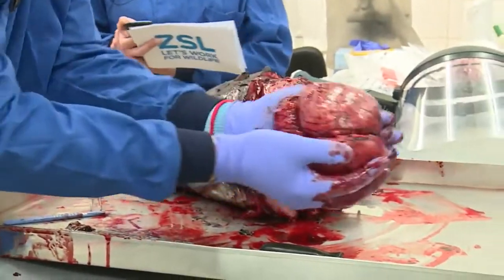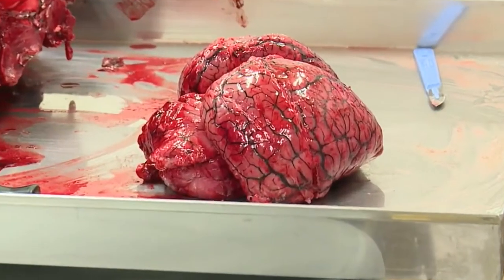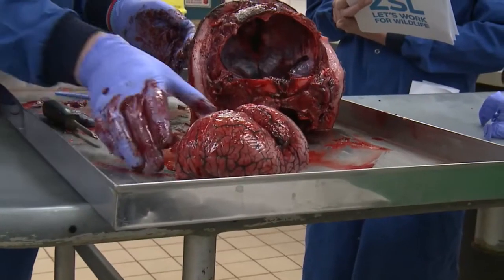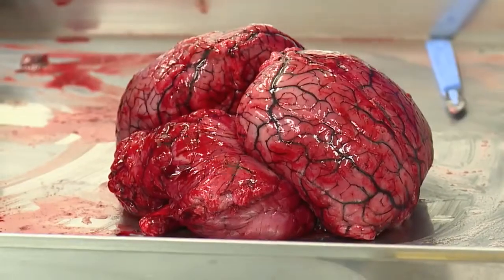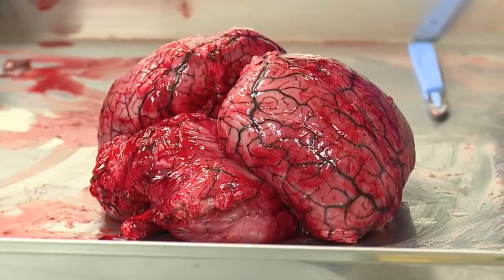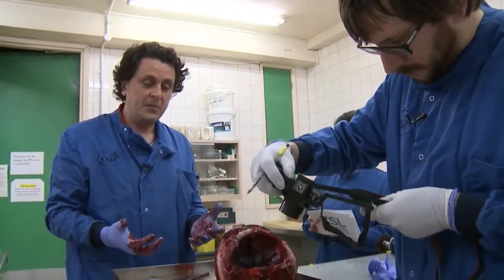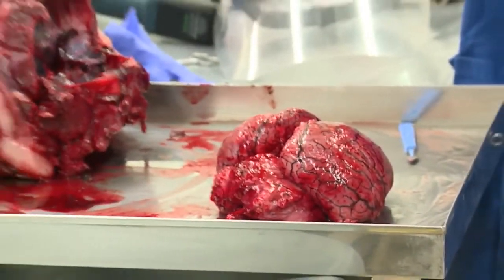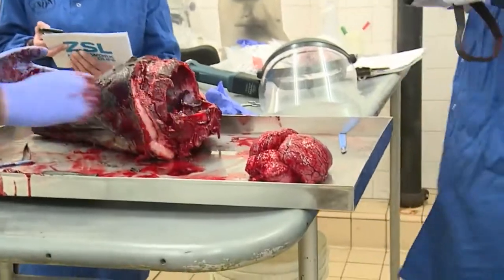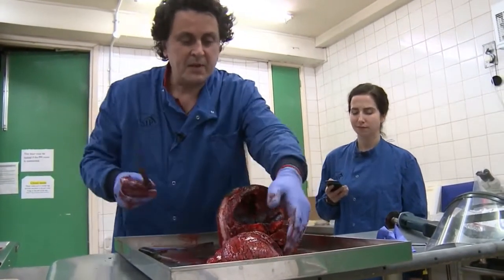Okay, all right, so there we go. There is a cetacean brain. This came out all right, actually. So hopefully that's visible on the camera. Again, we've got these two halves of the cerebral cortex, or the cerebrum. Not as folded as the human brain, people will see that, but it's still a highly specialised mammalian brain. And underneath that we've got the very large cerebellum with the spinal cord sticking out. It looks to be pretty normal.